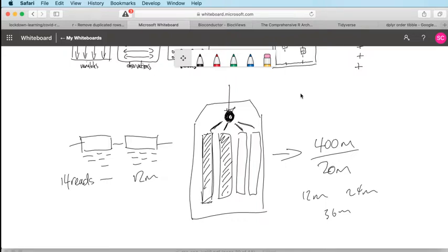so that's sample 1, and then you might have sample 2 where you've got the same gene, but you've got a lot more reads. I'm not going to count this time, but say you've got 28 reads, so twice the number of reads.